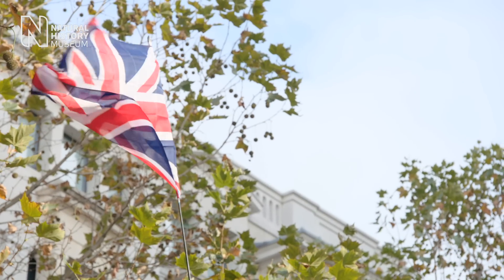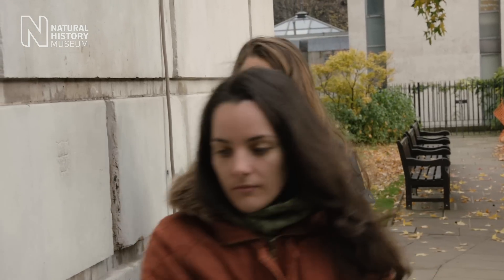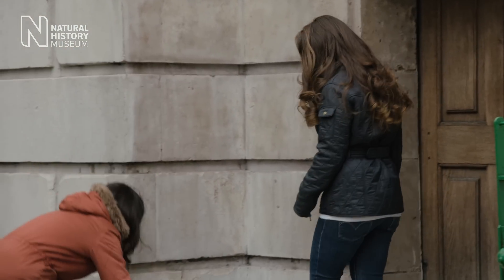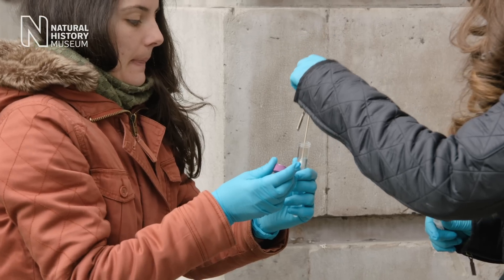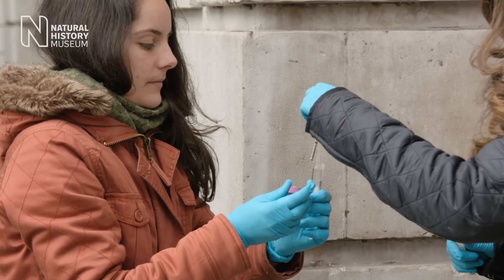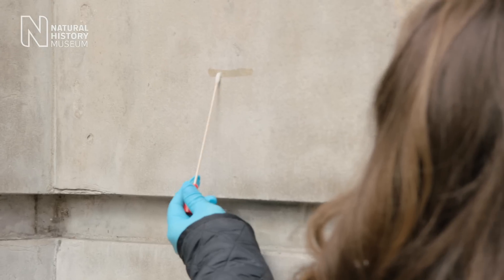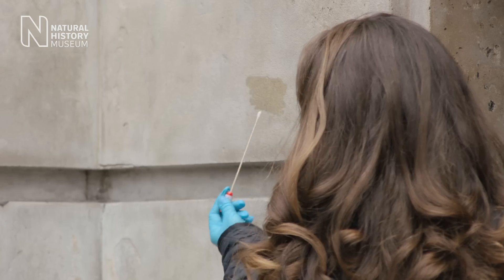250 schools all over the UK are taking part in the Natural History Museum's latest citizen science project, Microverse. They know what they have to do: collect samples of microorganisms from buildings in their own environment. But once the samples have been collected, where do they go, and what will happen to them?